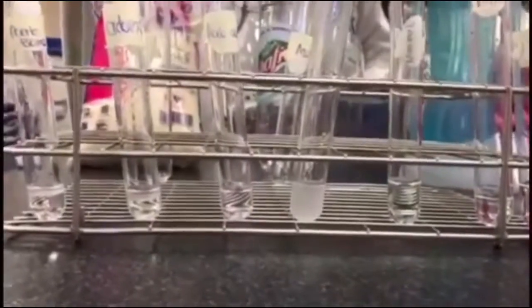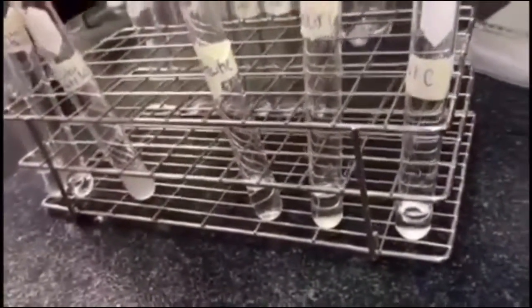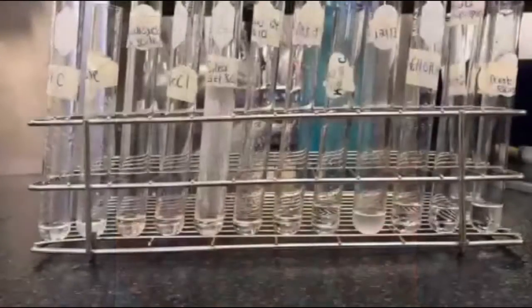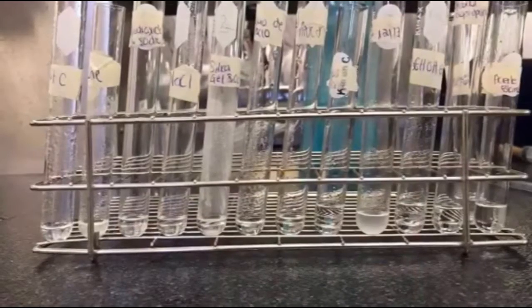In the melting point test, we could see that the materials indeed start melting at the temperature where they were supposed to melt. Some of the solid components that we used were insoluble. Some of the solid materials that were not soluble in water were soluble in acids and in benzene. Most of the liquid solutions that we had were soluble.